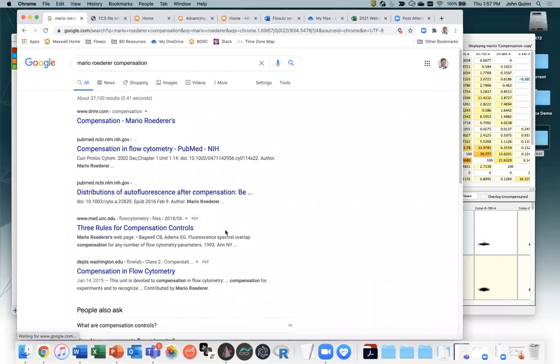I think that is a pretty good beginning place right there. He is perhaps one of the more respected names in cytometry, and if he ever listens to this webinar, he would yell at me for calling him respectable. But anyway, drmr.com, I believe, has been up for many years and is still accurate.